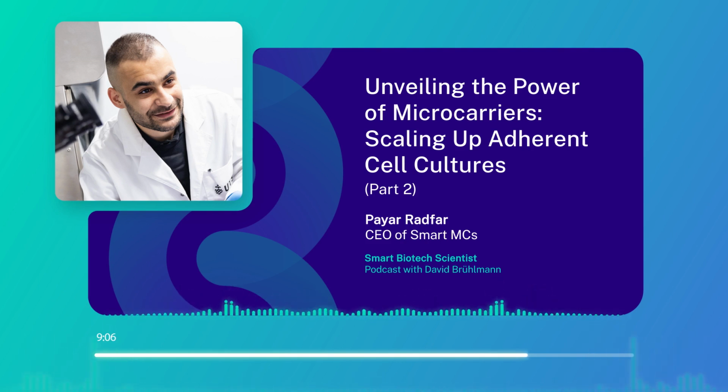So the key thing for people, I'm thinking more about people who are in the bioprocessing field and doing a lot of cell culture, is being flexible to new technologies. The field is struggling a lot where there's a lot of innovation happening, but there's not much adoption, and not necessarily because the technologies are not there yet. It's more like, can you convince, let's say, a CDMO to go out and change their entire filtration, for example, from product A to B? Well, it will save them money, but do they want to go through the hassle?